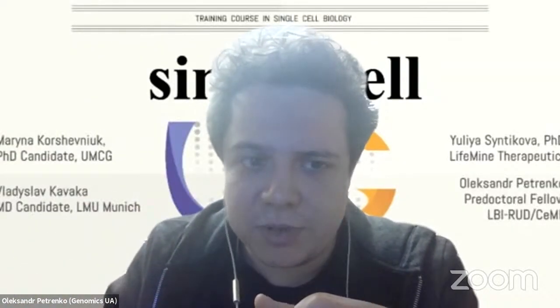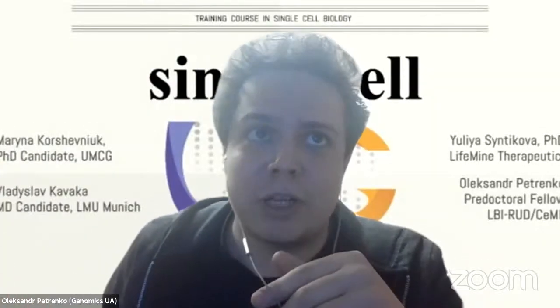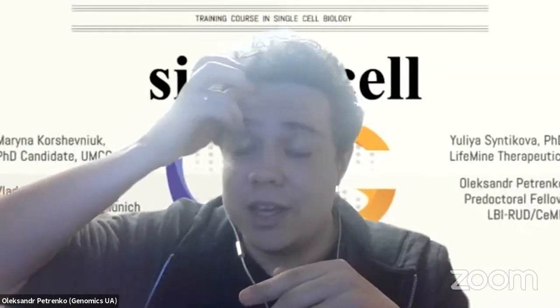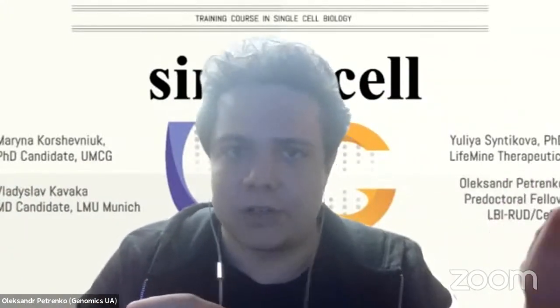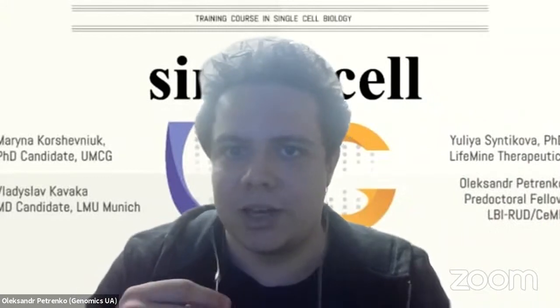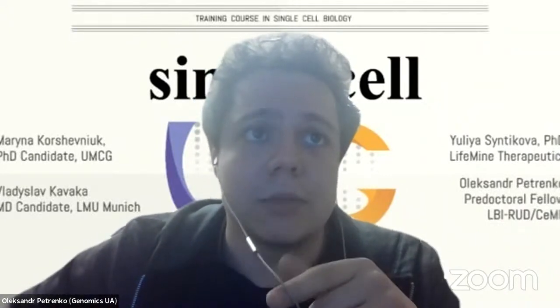I just think that the example you showed in the matrix was from a bulk-seq experiment, right? Because it was just the control versus treatment. And usually we see just cell number 1, number 2. I mean, they're not named 1 and 2, but in principle there are cell number 1, 2, 3, however many you sequenced. And the y-axis is always, in this particular example, genes. So you always see the information for these specific cells, which genes are expressed how much. That was the idea of that demonstration.